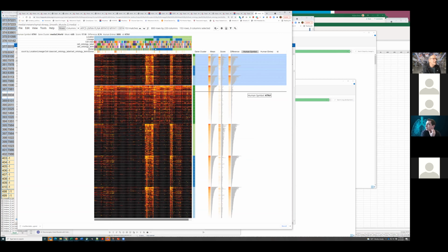So here are all those genes that were a hit in the proteomics, and when you look over this, it's smooth muscle and smooth muscle. So you can see that it's two smooth muscle cells that are deeply enriched by those hits. But I think we want to be able to set up XY plots so that we can really see outliers, protein versus transcriptome.